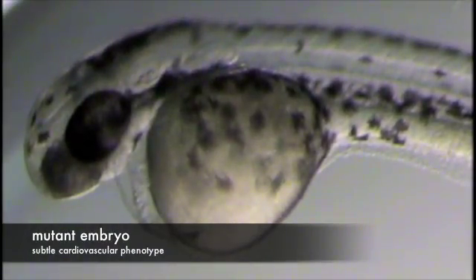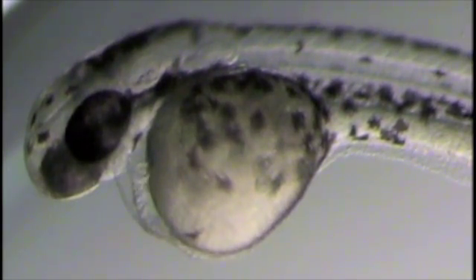And here is an embryo of similar age that has been injected with a morpholino to block a gene that controls the rhythmicity and force of contraction within the heart.